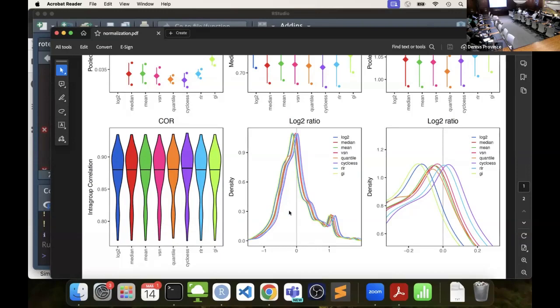This is formalin fixed paraffin embedded tissue samples. So they have a lot more variability, more things that may generate some different levels of protein. But what I'm looking for on this ratio is the center of that fold change, the density should be around 0, where you're not shifting it to a positive fold change or negative fold change just by normalizing the data.